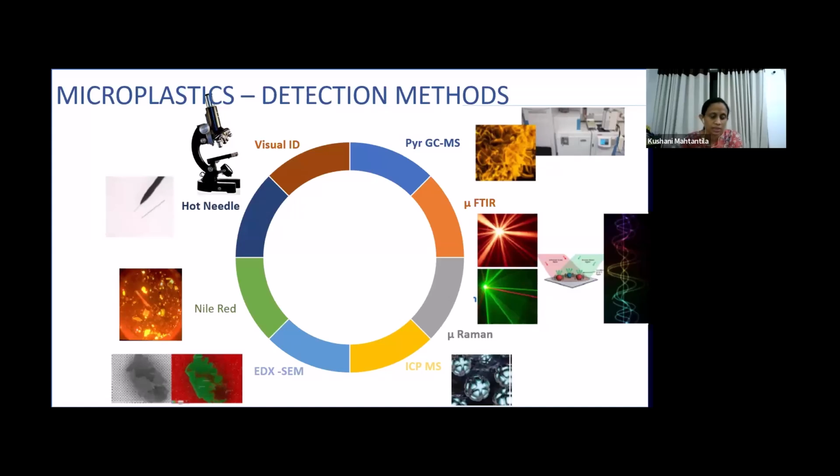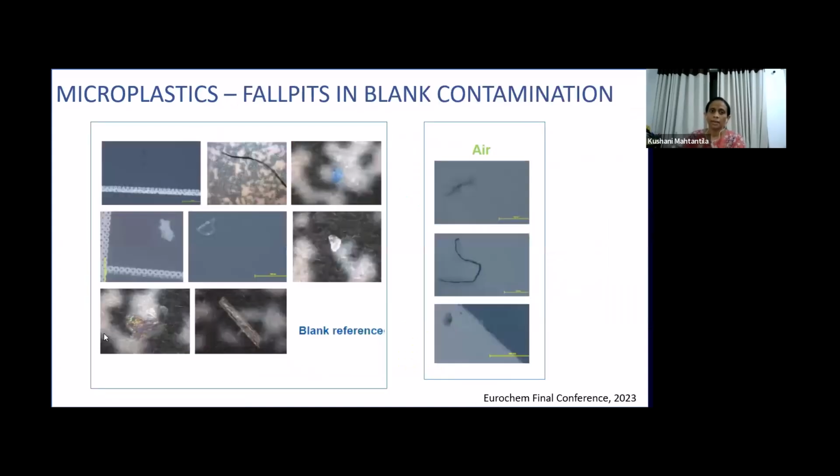In 2025, the ISO methods of water analysis will address the micro FTIR, micro Raman, and pyrolysis GC-MS methods. What are these particles?